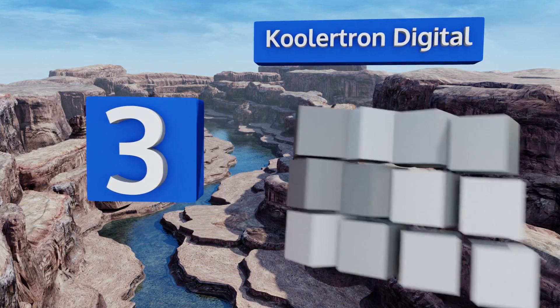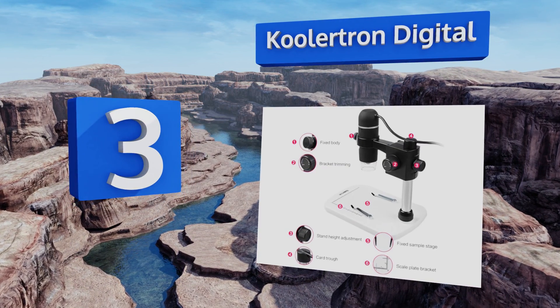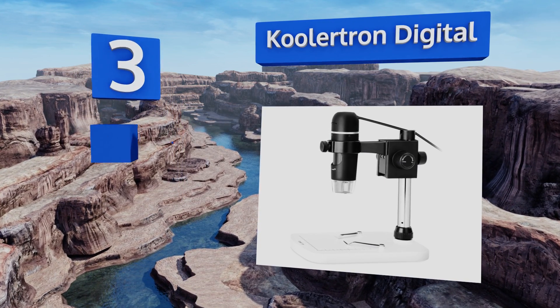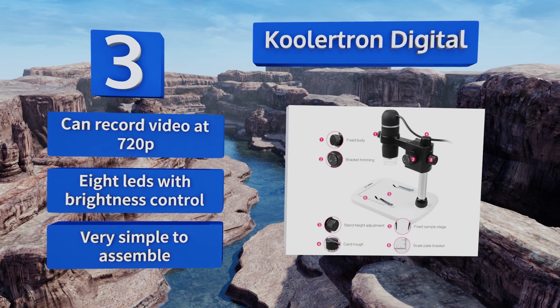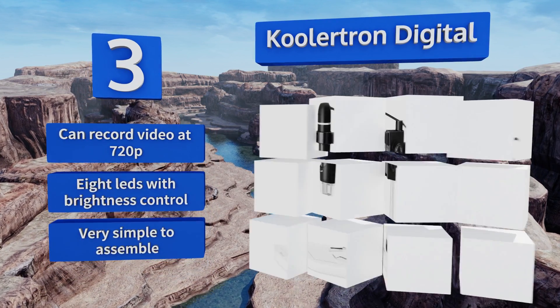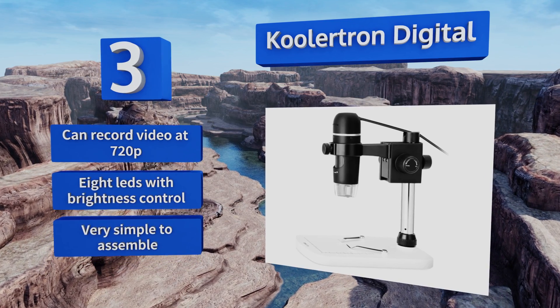Nearing the top at number three, the Coolatron Digital is a great option for those looking for something between a bargain and an average-priced device. It's a little stiff when making precise adjustments, but otherwise it's of impressively high quality, capturing images of up to 2592 by 1944 pixels. It can record video at 720p and is equipped with eight LEDs with brightness control.